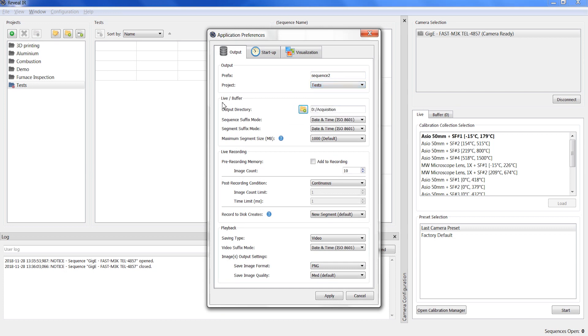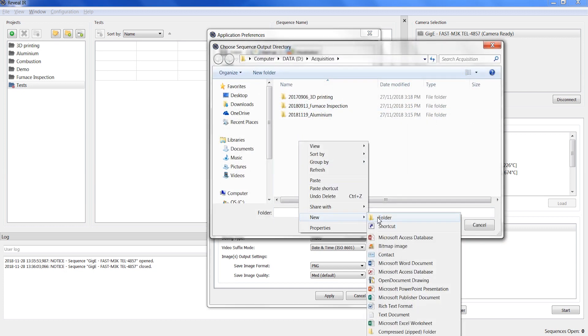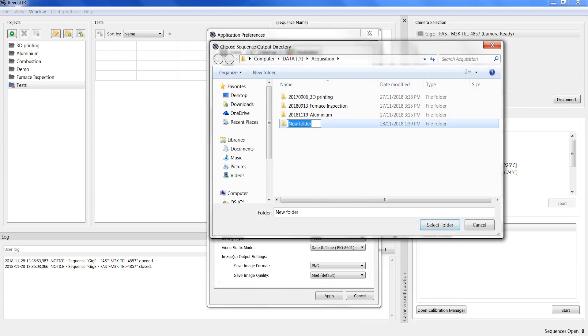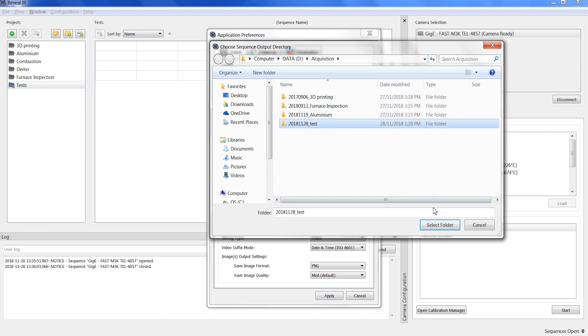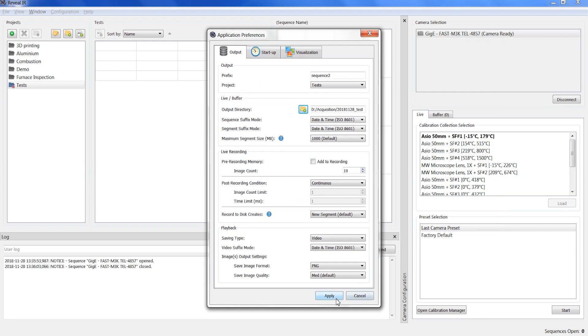The live buffer section is used to set the output directory where your sequences will be recorded to disk. It is recommended to set the output directory on a different hard drive that is reserved for data acquisition for best performance.